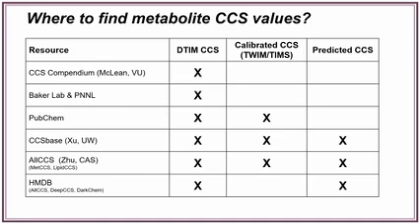And lastly, HMDB also has collision cross-section values. They're going to be a mixture of drift tube values and predicted values. And for the predicted ones, you can actually pick from a couple of different prediction algorithms that you're interested in looking for. So it will give you the prediction from All CCS, Deep CCS, or the DarkChem CCS prediction algorithm. So I wanted to make sure we got that so you can get your picture and have it on hand.